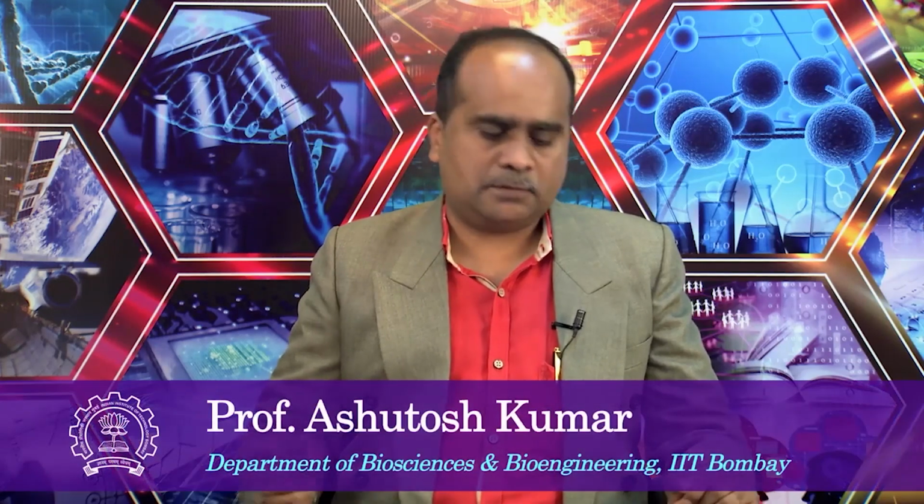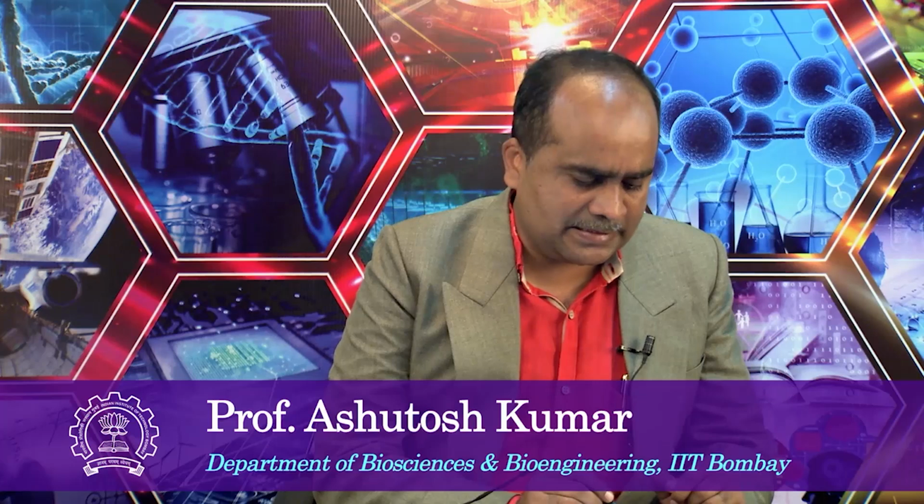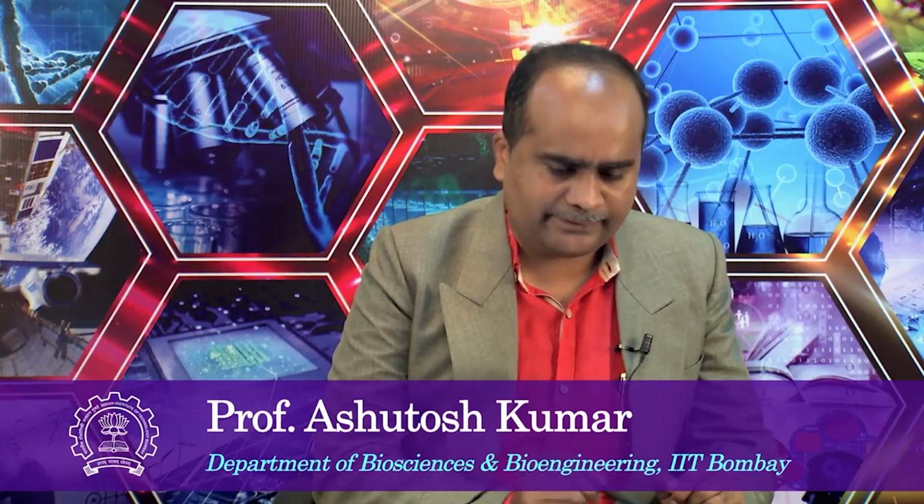So, welcome to today's lecture. We will continue with polarization transfer, and we will go into a little more detail on the nuclear Overhauser effect. If you recollect, in the last class we looked at what the nuclear Overhauser effect actually is, how the experiments are done, and what we can get from nuclear Overhauser effect related spectroscopy.